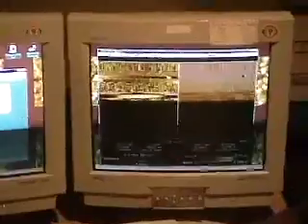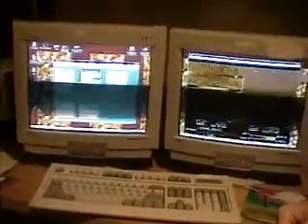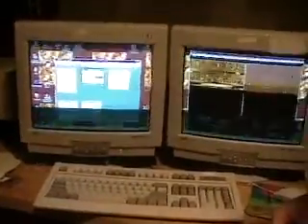Under other controls, the only one that you would ever change here is the Z limit. Right now that's set to 6.3 microns, so that's the maximum amount that the feedback system can move the base of the cantilever in Z. This system has, I think, a 16-bit analog to digital converter, and so that tells you that the minimum resolution in Z would be 6.3 microns divided by 2 to the 16th, and I forget what that is, but sometimes it's a little bit inconveniently big.